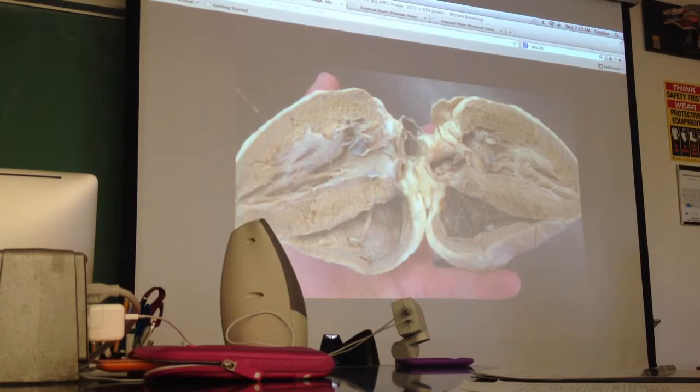The reason I know that this is the atrium versus the ventricle, which will be below, is that this region right here is the atrioventricular valve. I know that because I see the chordae tendineae. Those chordae tendineae are really helpful in deciding a lot of things about the internal structure of the heart. If we can find them, we've found essentially 5 or 6 structures. We know they attach to the papillary muscles, so all the muscles they go down to are the papillary muscles. The structure above them is the atrioventricular valve. Everything below that is a ventricle, and everything above that is an atrium. So the first thing I like to do when I cut open the heart is find the chordae tendineae, because it helps you orient yourself.